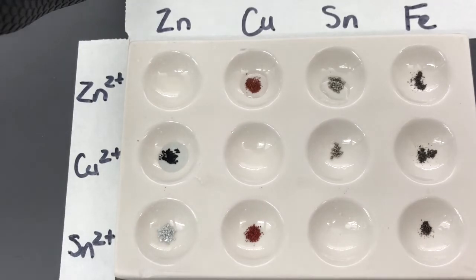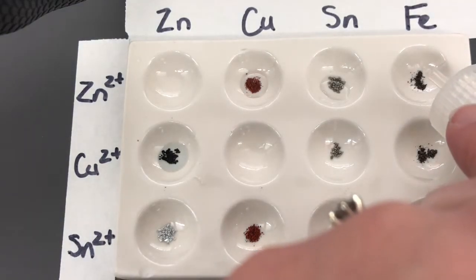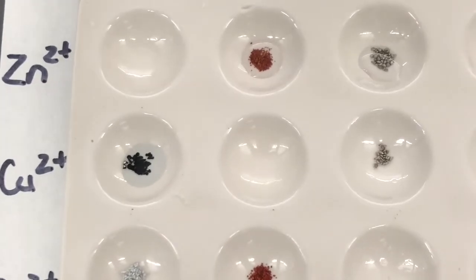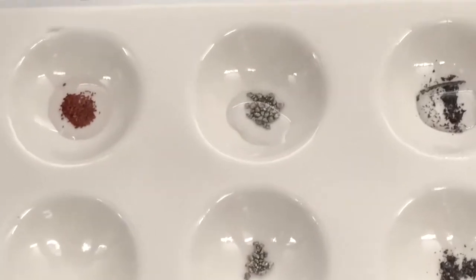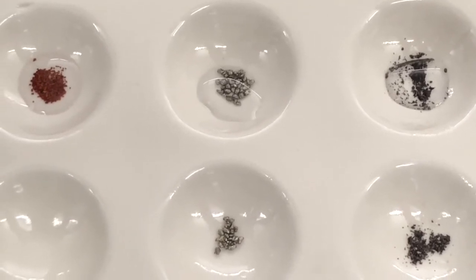And the immediate result is it does not appear to be any reaction taking place, but we can revisit that later. And then with the iron, we add the zinc to the iron. And again, it disperses out the particles a little bit more. I can zoom in on that area for you, but you're not seeing a big change in what's happening. It's simply the solution with the solid inside of it, no reaction.